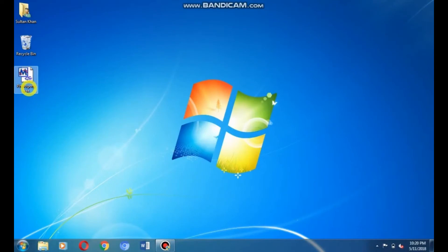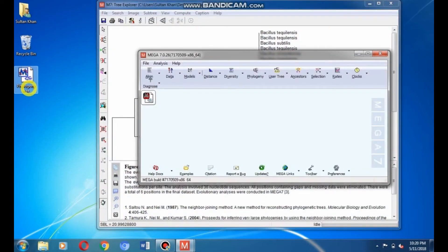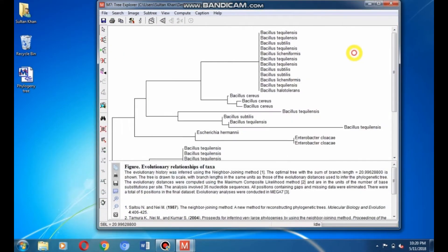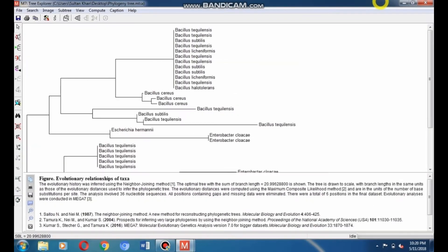First, make a phylogeny file using MEGA7 software. Double-click on the phylogeny tree file to open it, then maximize the phylogeny tree window.